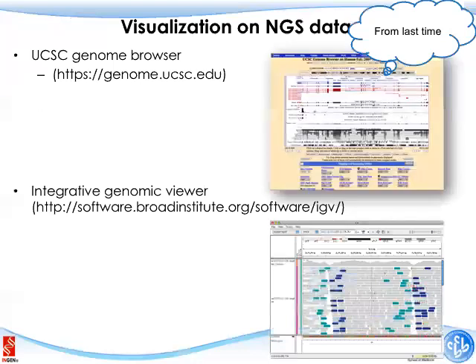And we actually talked about visualization tools a little bit. So basically, there are two things that at least my group uses very regularly. One is the UCSC Genome Browser, and the nice feature of this tool is that not only do they provide a huge amount of annotations. Basically, for every single genomic location, what are the genetic functions that we know of, and whether there's a SNP there, what are the conservation levels, is this in the introns or exons of the gene? Every piece of information that is available is supposed to have a track on that. So you can visualize what our knowledge is about each individual base.